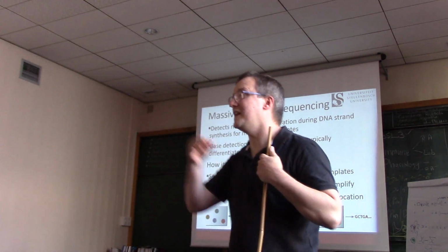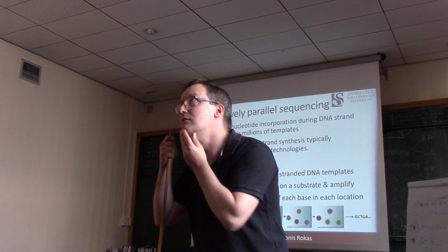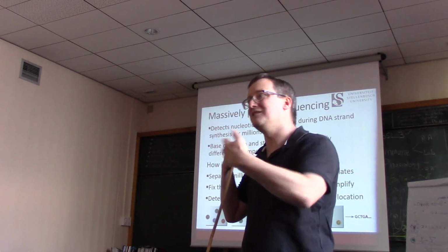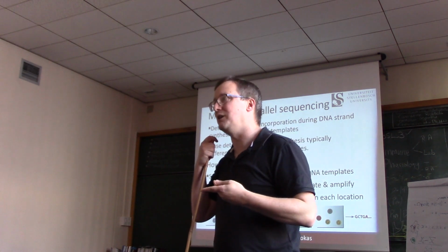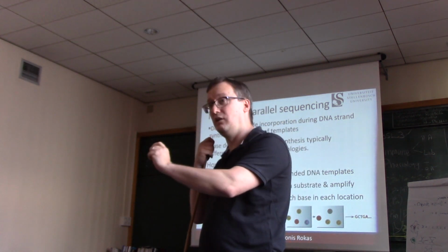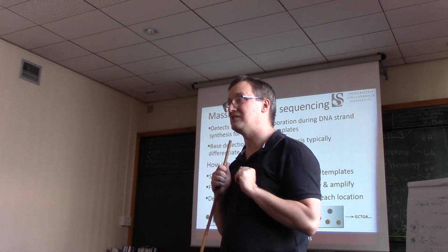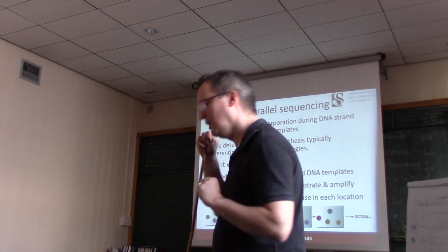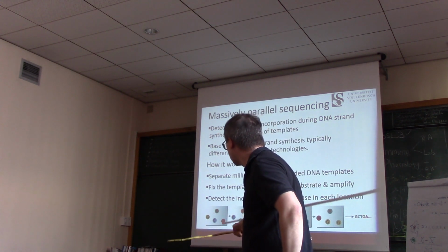But then if you look at the next frame, you're going to see that the mouth has moved just a little bit, and the arm maybe has swung down, right? So our eyes are tricked into seeing this motion by repeatedly replacing the image that we see on screen. In the same way, we have a time-resolved signal that we're receiving from many different templates, all being sequenced at the same place. So let us imagine that our massively parallel sequencer has relatively few templates being sequenced all at the same time.